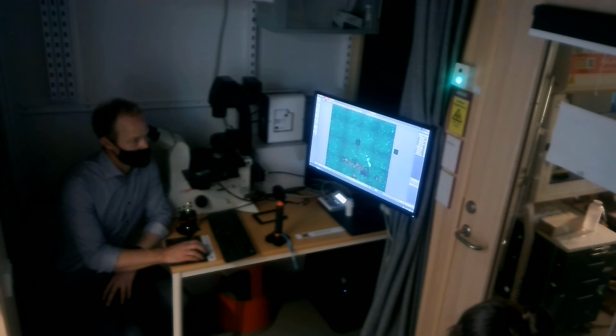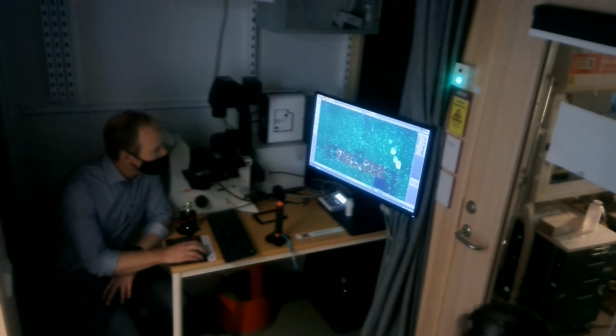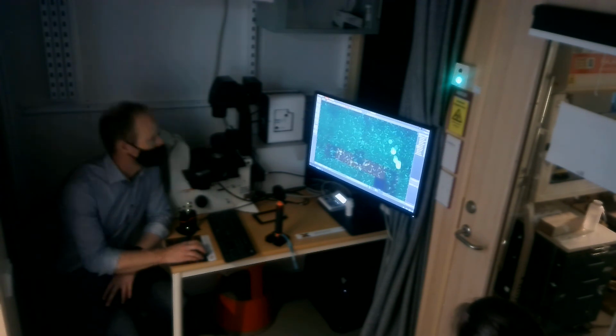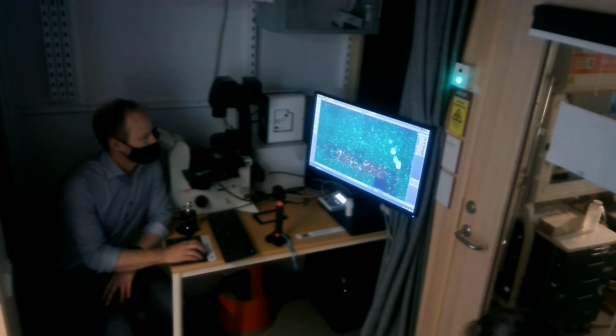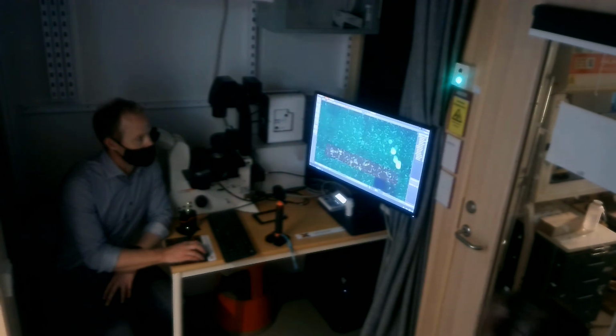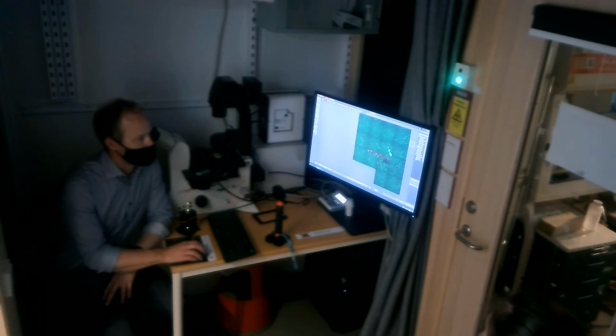But we also have stuff that is called series. And series, that's what we captured. Those also show up here, so we can remove them. Let's see if we can find a series. I was wondering where this series was. Okay, can't remove it. So we can view or remove, like just visually take something away to see less, but we can also actually remove previews that we've done.